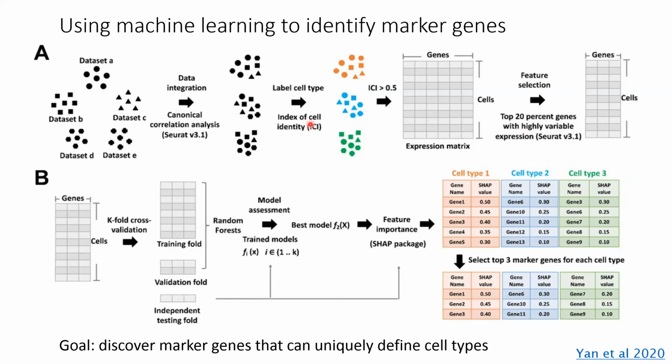So there's essentially two main steps in using machine learning to define a set of maximally informative genes for cell type clustering that I'm illustrating here. The first is defining the supervised approach. So this requires that researchers label cell identities prior to training the algorithm. This can be done using orthogonal measures of cell identity, as in this case, they again use this Arabidopsis root fluorescent microscopy data to label cells into classes. But obviously you have to be careful here because how you label your cell types will define your results.